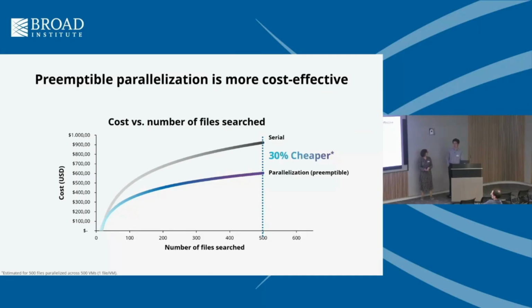Definitely, great question. I've been using it recently, and what I would notice is that the improvement in runtime and cost starts from about 25 to 30 files. It used to take a few days to search, let's say, 36 files. But now with the parallelized workflow, it only takes probably overnight, and then you have the result. So we started to see improvement at that level, and you'll see better results for larger experiments.